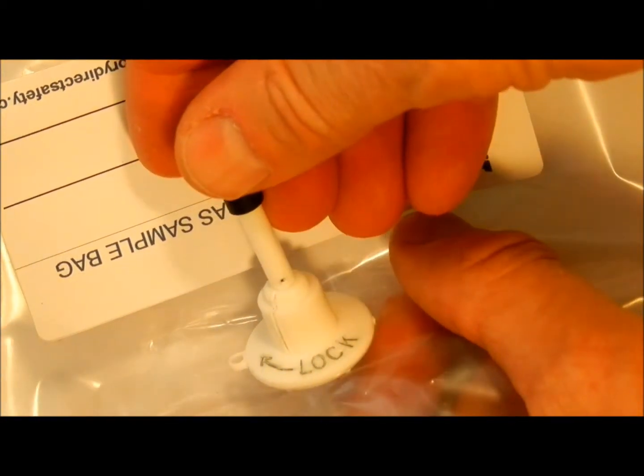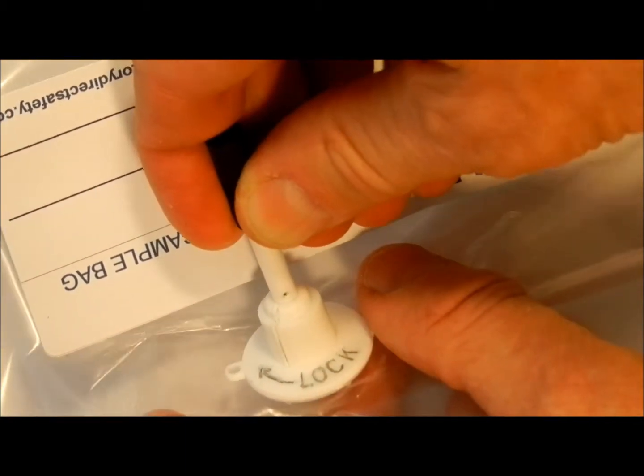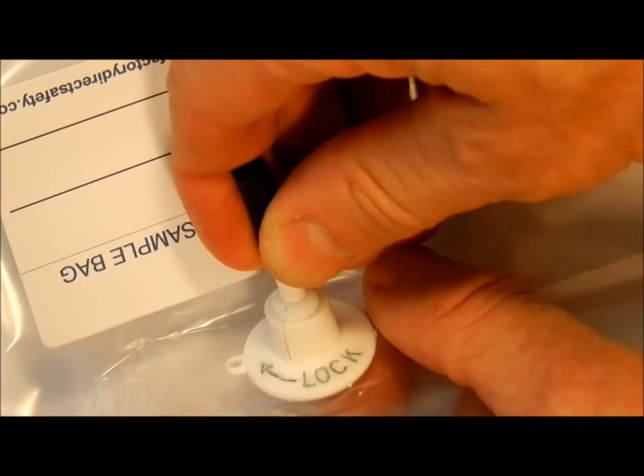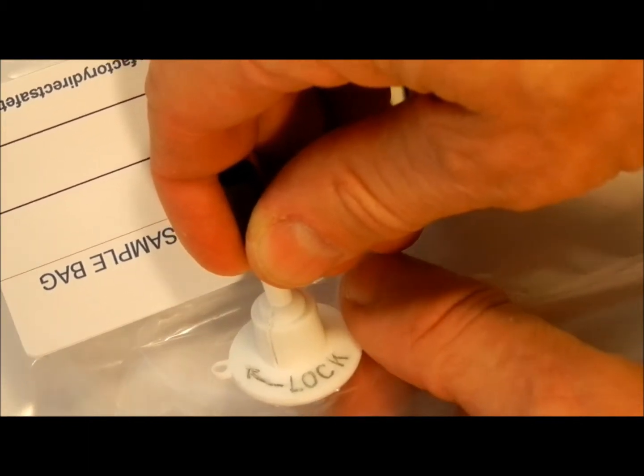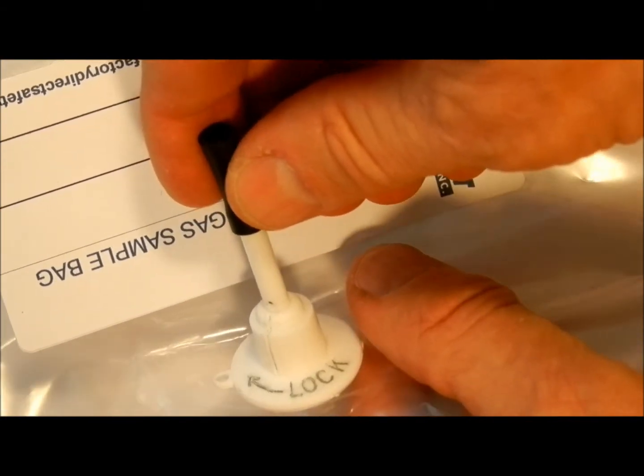Note that the valve cannot be locked in the open position, only in the closed position with the stem pulled out. When the valve is pushed in, it cannot be rotated and it is always open. So to lock the valve, pull out and rotate clockwise.